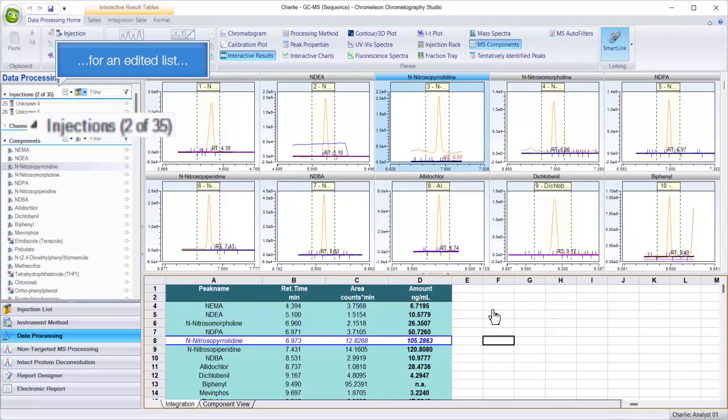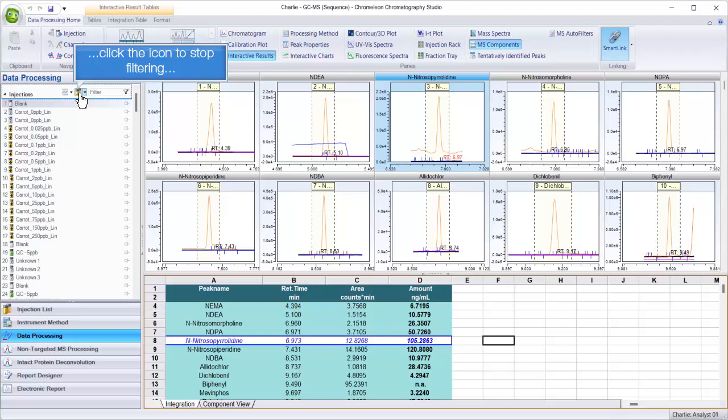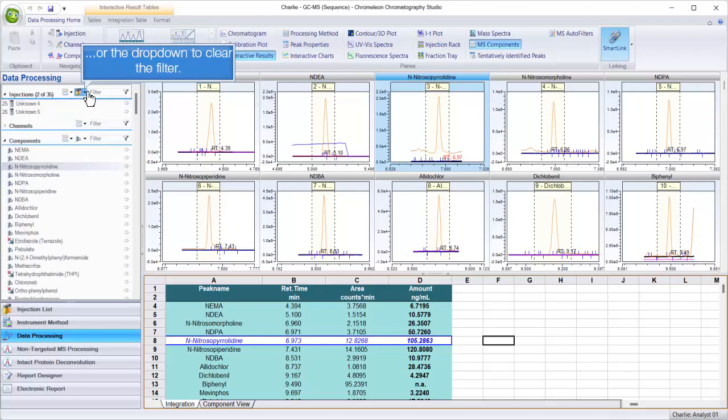For an edited list, click the icon to stop filtering, or the drop-down to clear the filter.